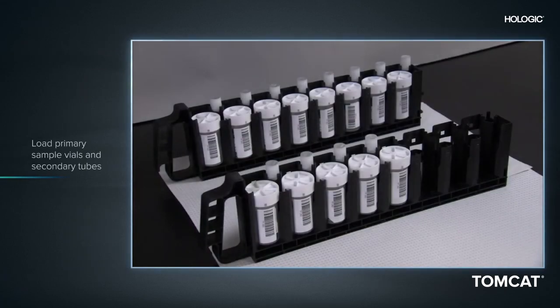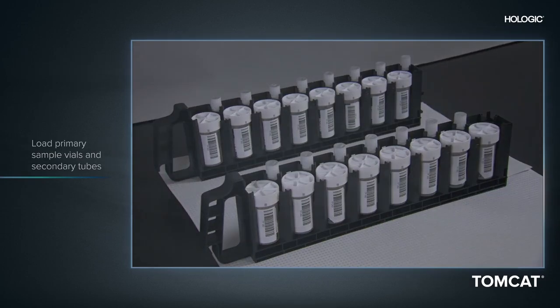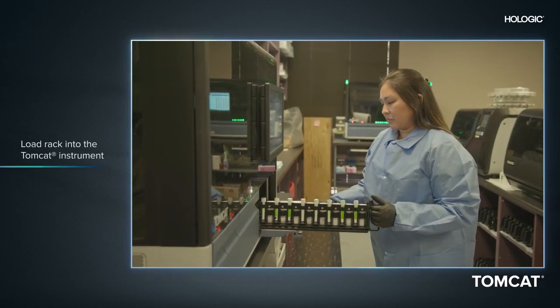The Tomcat interface is both ergonomic and intuitive. Start by loading primary sample vials and secondary tubes into input racks and slide the racks into the Tomcat instrument.